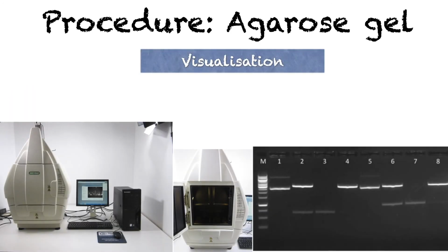After we run the gel, at the end of the running, we have to visualize the result. Otherwise, how can we compare our experimentation, or how do we know we have this result, or that it was the right thing we wanted to do? So we do visualization. And for the visualization, we have some software and some visualization equipment.